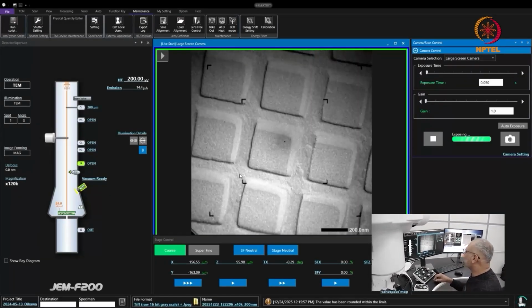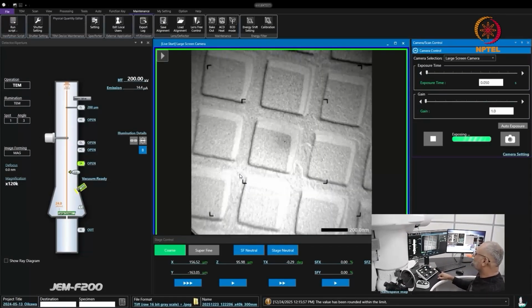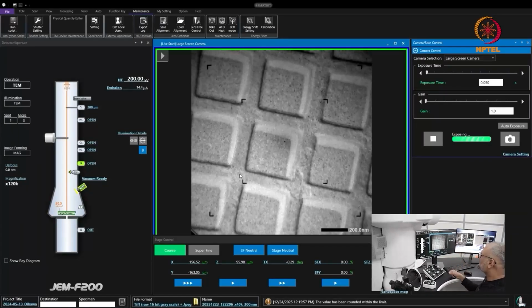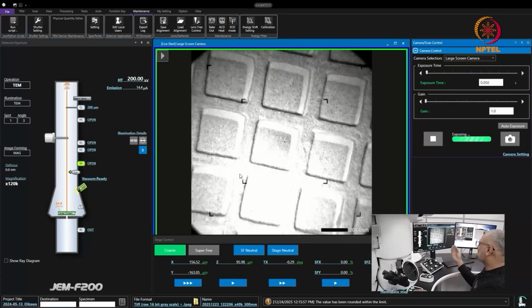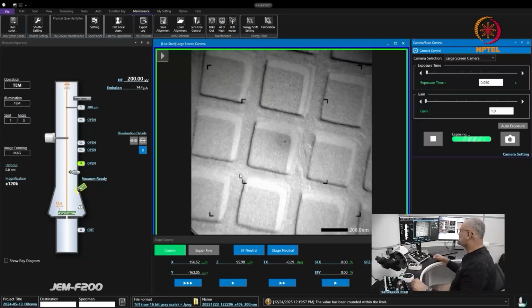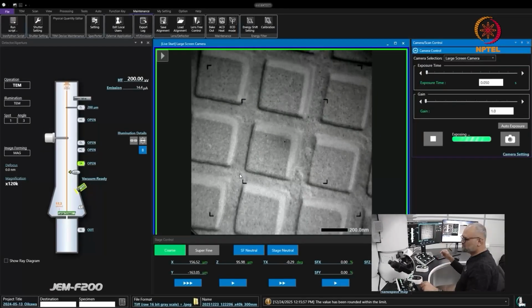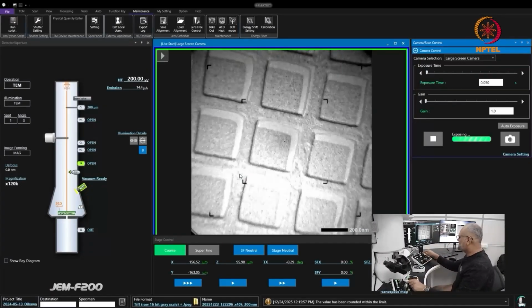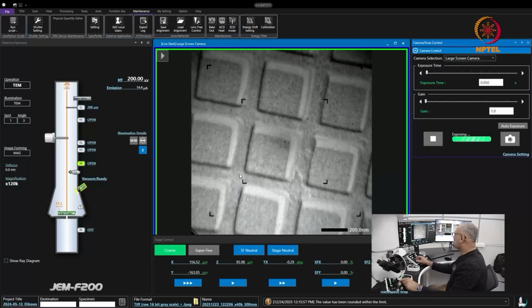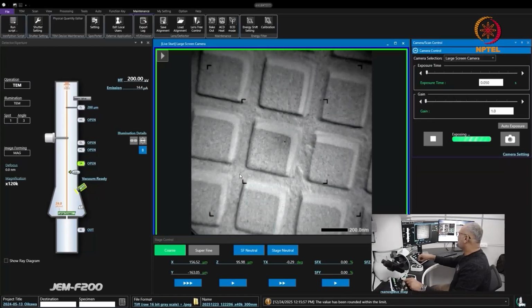I bring a feature of interest into the center, and I click this HT wobble button, and you see that the feature of my interest should move in a single plane. Most of the time, this correction is more accurate when done on the small fluorescent screen camera, or on the fluorescent screen here through the binoculars, but you can also do it here. So after I've selected the HT wobble, I need to turn my stigmation knobs and the deflection knob.